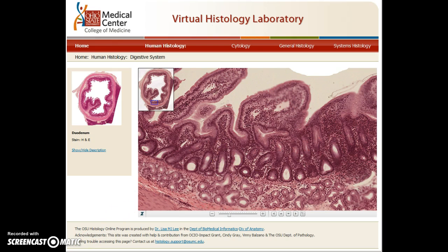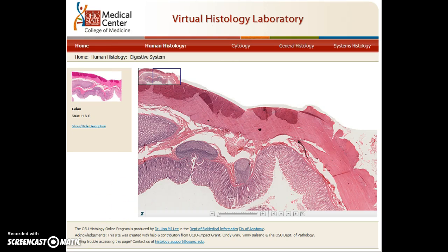Okay. For the colon, or the large intestine, this slide looks kind of upside down. This purple is the mucosa, this is the submucosa, and a larger muscularis externa, although the only thing we should see here is the inner circular, because the outer longitudinal layer has narrowed down to that one little band called the taenia coli, and then there would be a serosa around the outside.